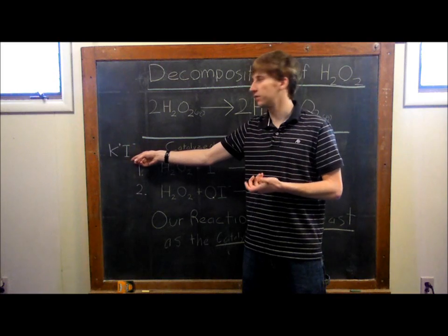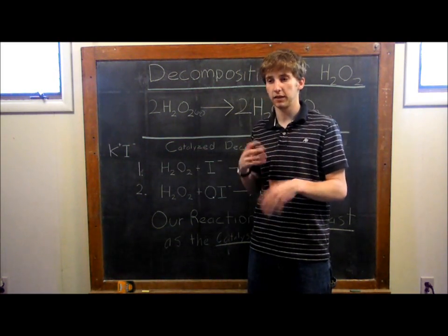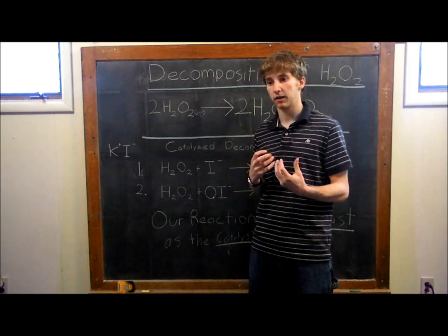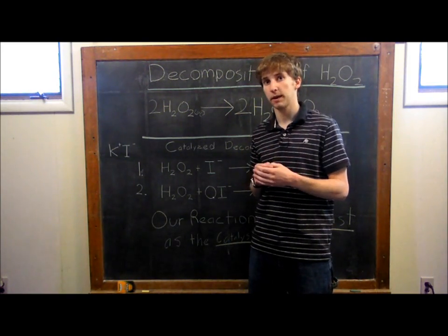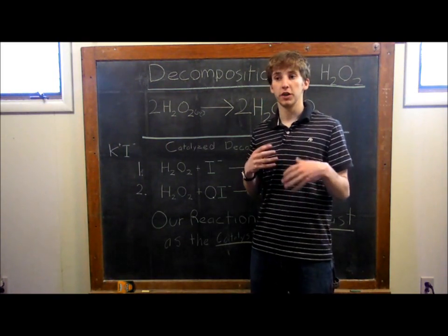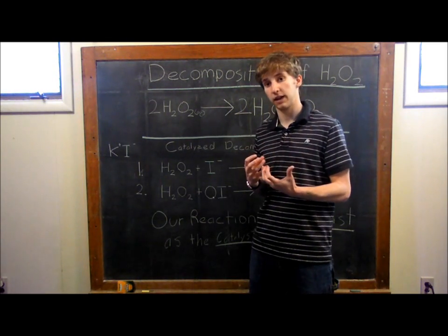This is just a simple chemical compound, while yeast is an actual living organism that is often put into baked goods to help them rise. Luckily, however, there are certain enzymes in yeast that can catalyze reactions. And Brianna has actually talked about how enzymes can make reactions proceed faster and lower the activation energy and what have you. So the good news is that we'll actually get to see an enzyme catalyzed reaction.